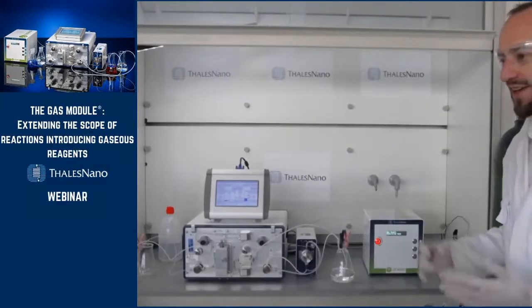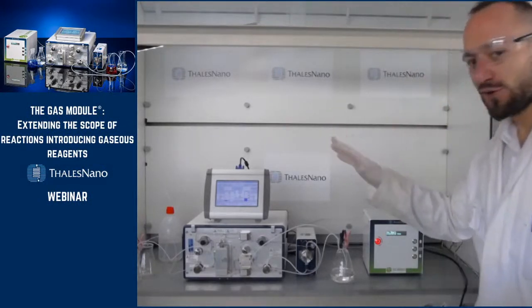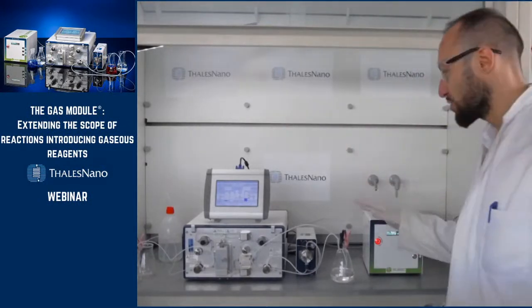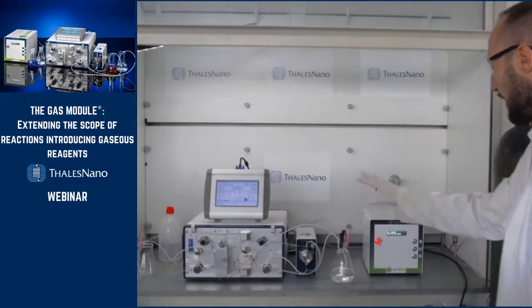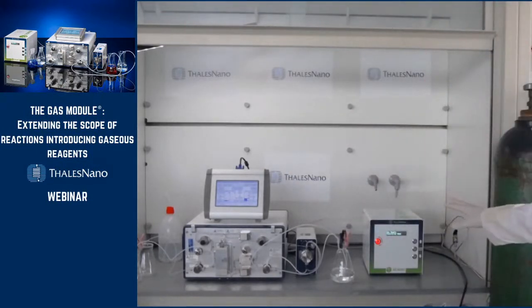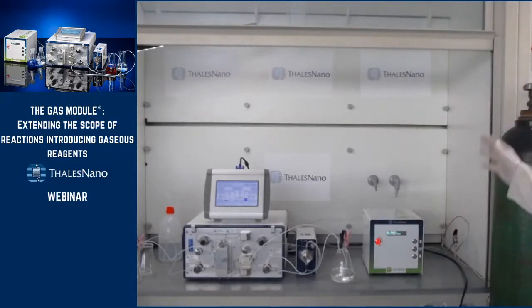Okay, I am now in front of the setup. For those who have seen the webinar about the H2Pro, you can easily recognize the H2Pro here, and this is the gas module. I think that's the first time you can see it for real in a laboratory environment.